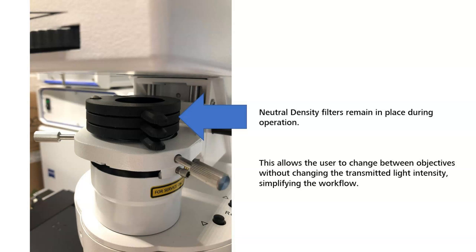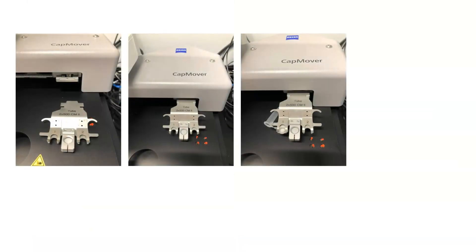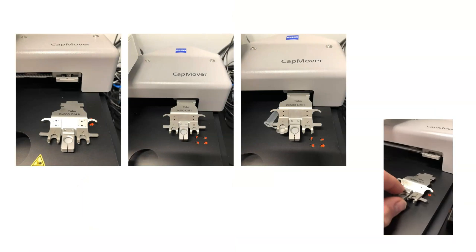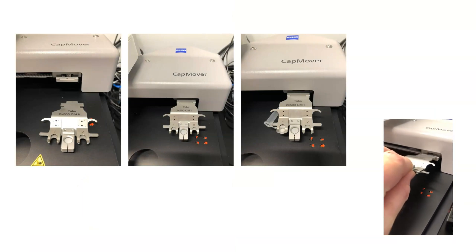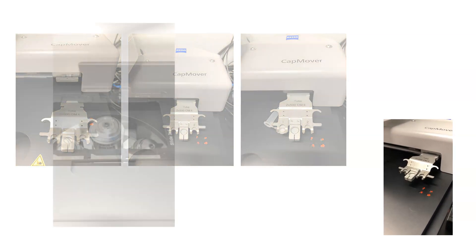As the RoboSoftware initializes the hardware, let's take stock of the microscope. Step one: on the transmitted light arm of the microscope above the condenser are a series of neutral density filters. They should remain in place while using the system in order to make it easier to find appropriate exposure times with transmitted light samples when switching between objectives. Step two, the cap mover or RoboMover should have a sample capture device in place. The capture device simply sits in place with the magnetic holder and is auto-identified by the system.